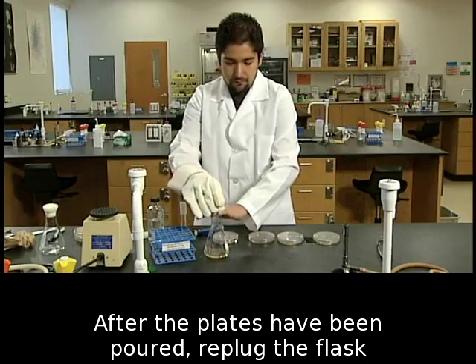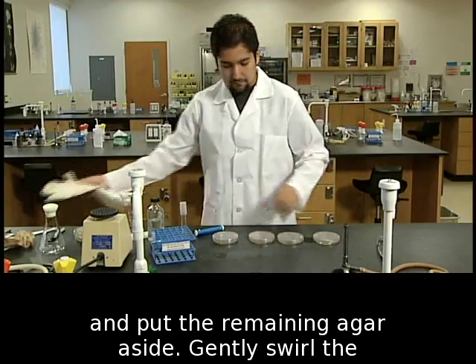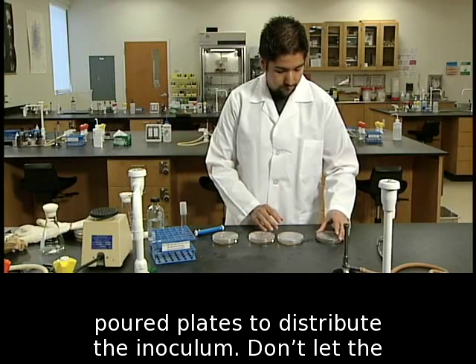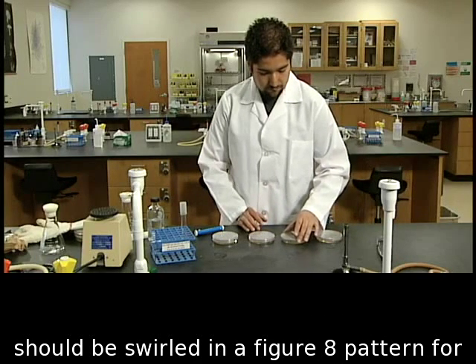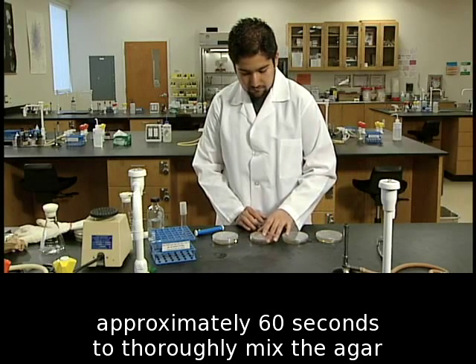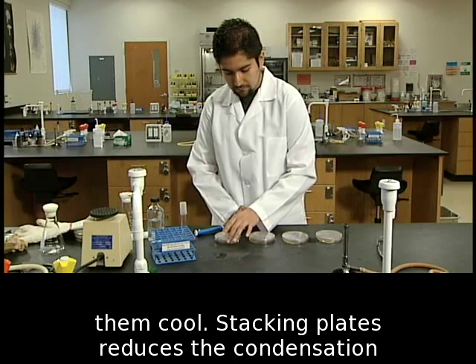After the plates have been poured, replug the flask and put the remaining agar aside. Gently swirl the poured plates to distribute the inoculum. Don't let the agar splash the lid or over the bottom. The plates should be swirled in a figure-8 pattern for approximately 60 seconds to thoroughly mix the agar with the diluted sample. Then stack all the plates to let them cool.